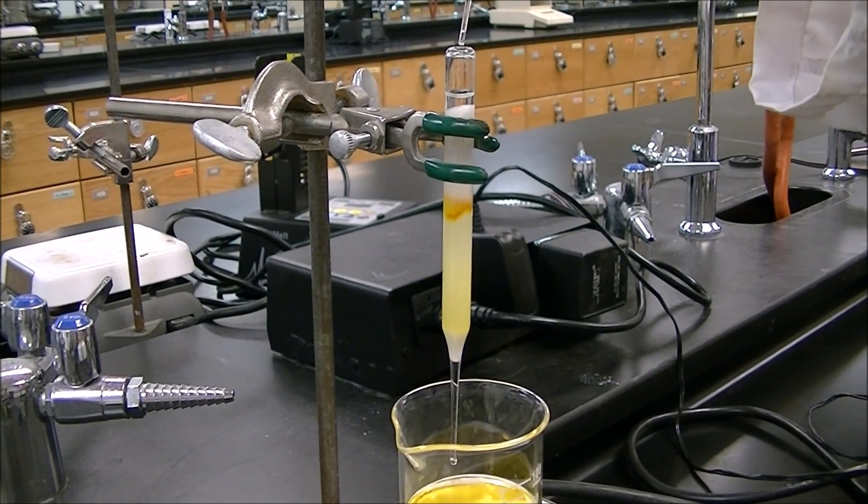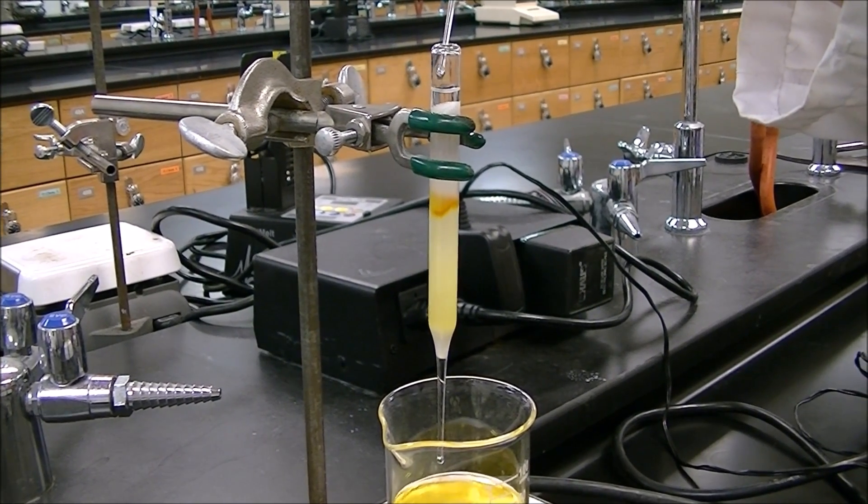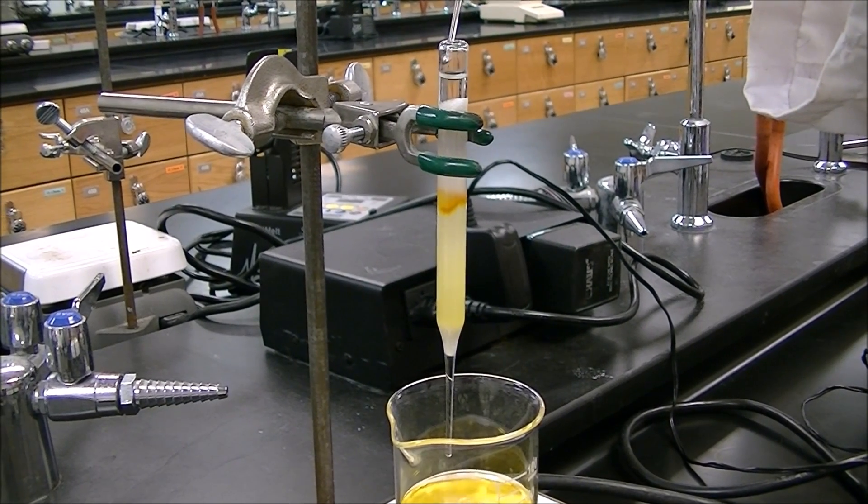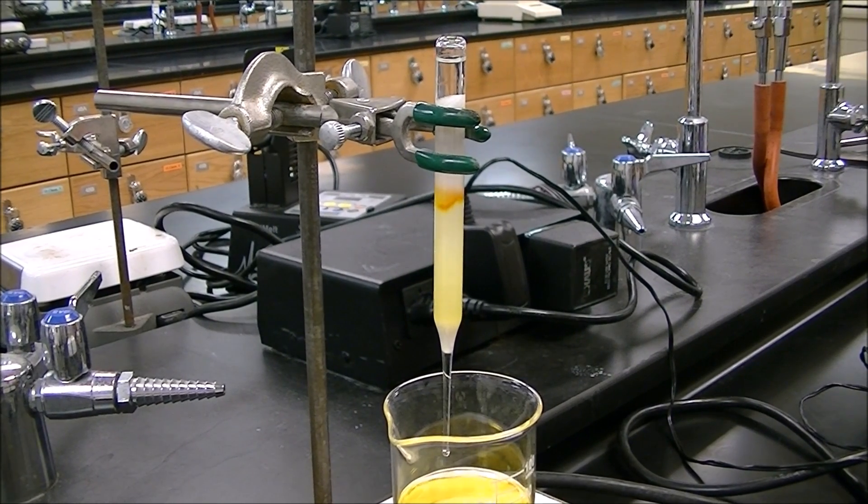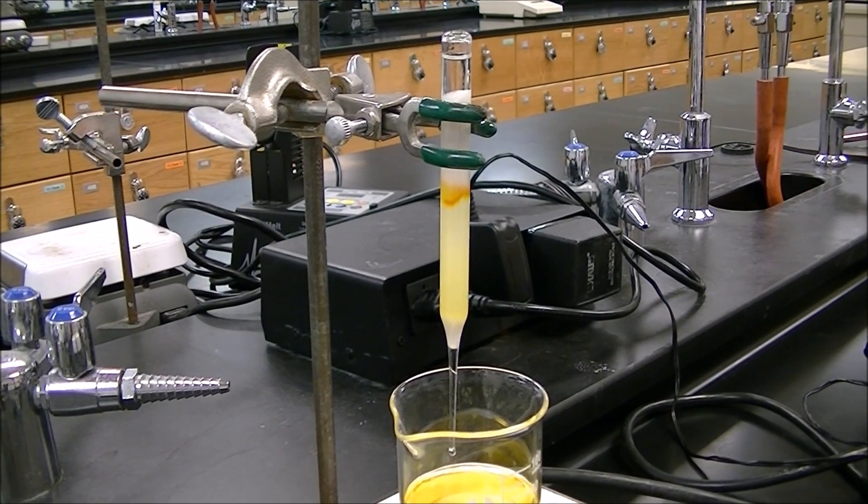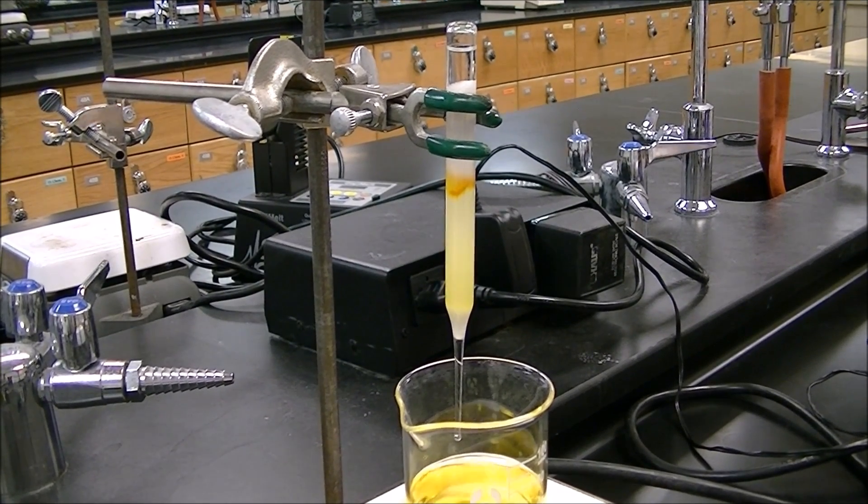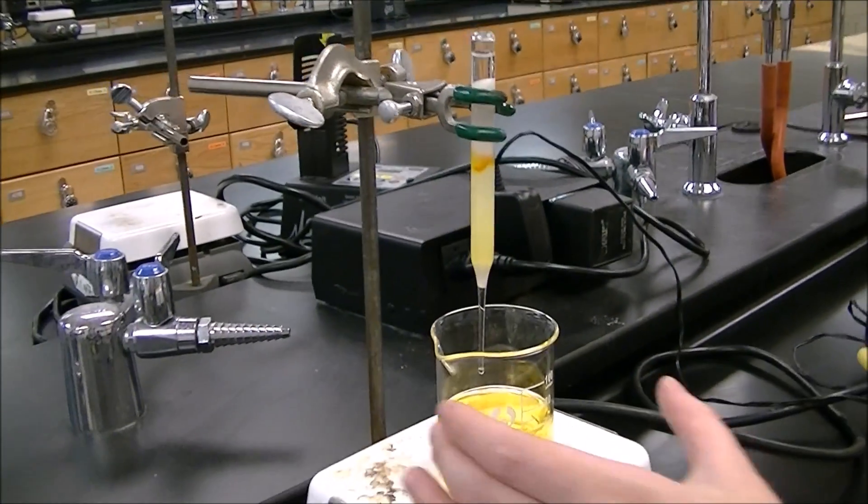We've got our cis isomer about halfway down the column and you can see that the solution below it is very light. And so we're mostly getting cis isomer out of the column now. So we're going to switch from our second beaker to our third one.